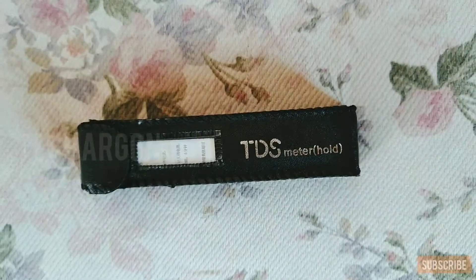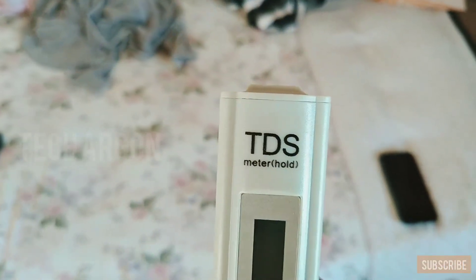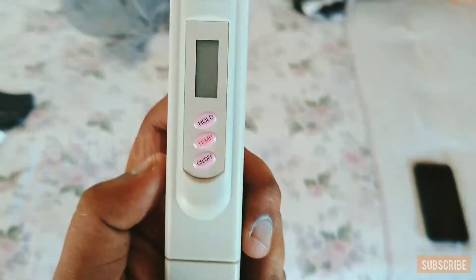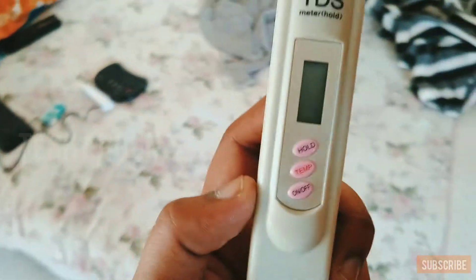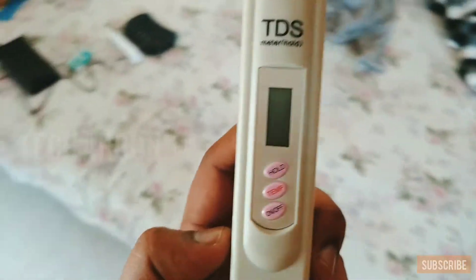A TDS meter is something with which we can identify the TDS of your normal home water. This is the TDS meter. It has a logo that says TDS meter, and there are three buttons: a hold button, a temperature button, and an on/off button. The temperature button shows the temperature of the water, and the hold button locks the TDS reading on the display after measurement.